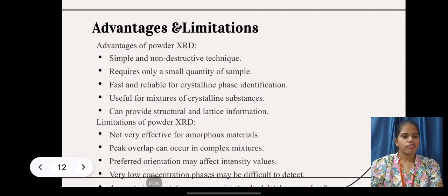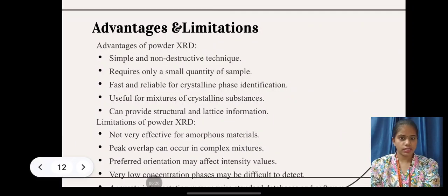Limitations: not very effective for amorphous material. Peak overlap can occur in complex mixtures. Preferred orientation may affect intensity values. Very low concentration phases may be difficult to detect. These are the few limitations.